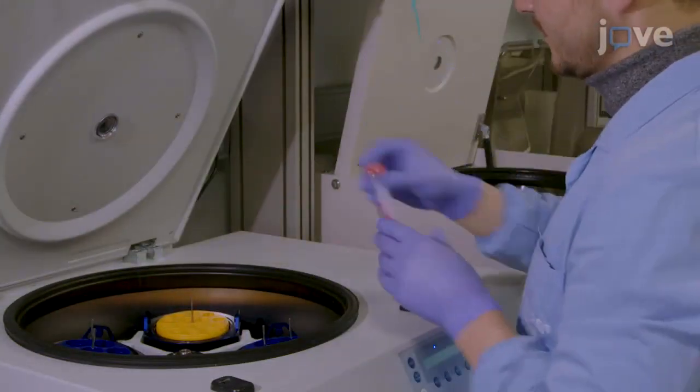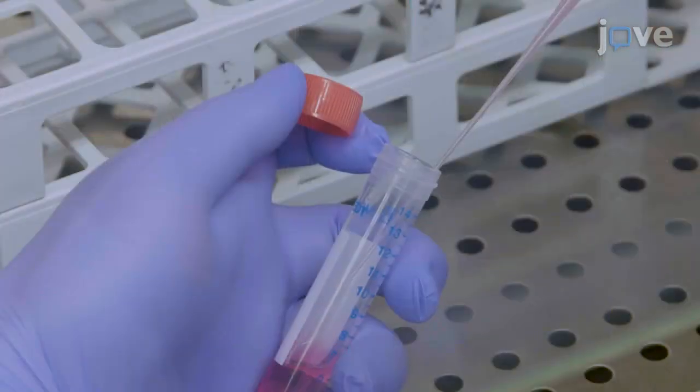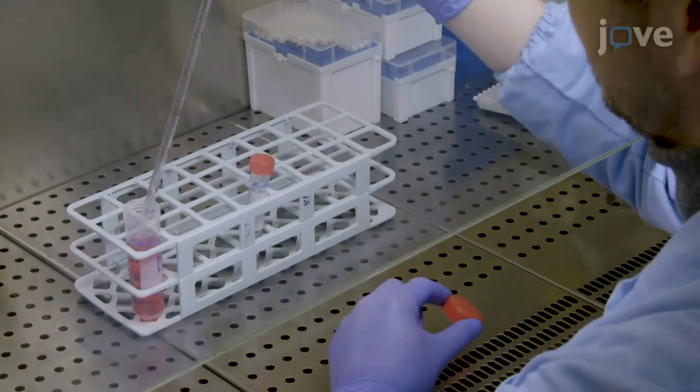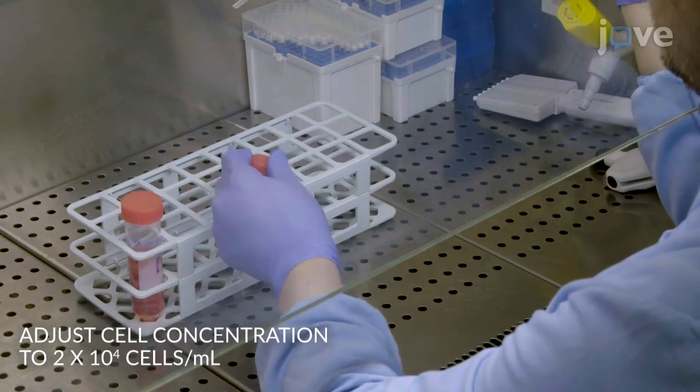Centrifuge the cells at 300 times G at room temperature for 5 minutes. Then carefully remove the supernatant. After counting the cells, resuspend the cell pellet with EB differentiation medium.